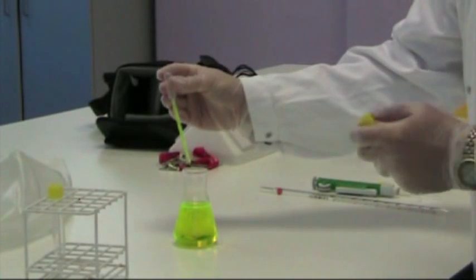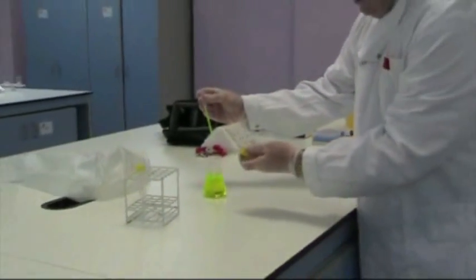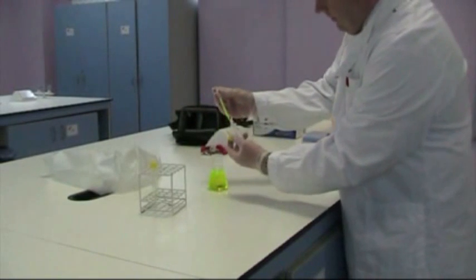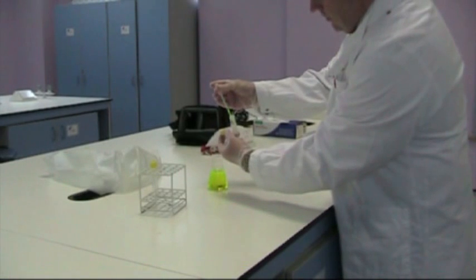So to dispense, you are obviously wearing gloves because we don't know what this chemical is. If you unscrew the cap of the vessel you're going to put it into, just put it in and then just gently squeeze the top.